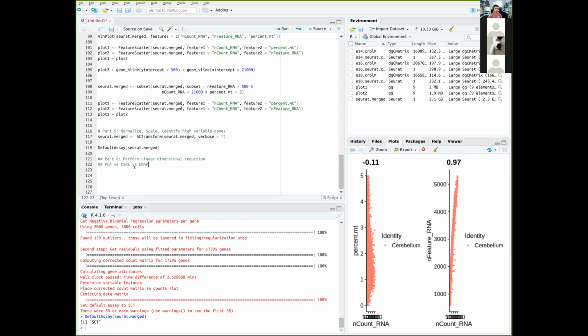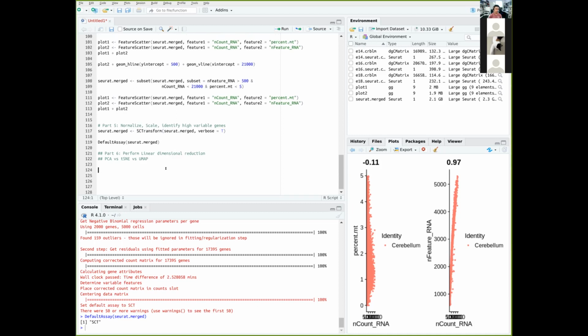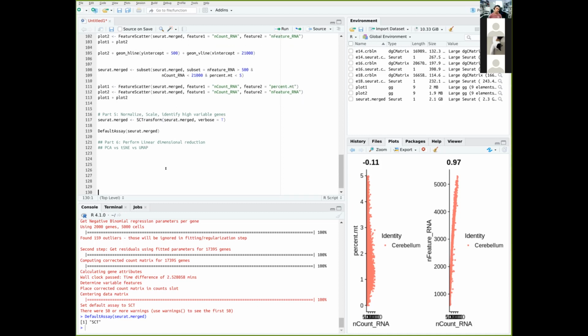All right. So we're going to do the PCA plot first. Usually with PCA, well, you can choose which one to plot. You can choose that you want to do UMAP or t-SNE, but a lot of these functions actually rely on the initial data from PCA, because PCA gives you these compressed principal components that will then be built upon to generate the t-SNE and UMAP. So we will run the PCA reduction first and visualize it, followed by the other two dimensional reductions.